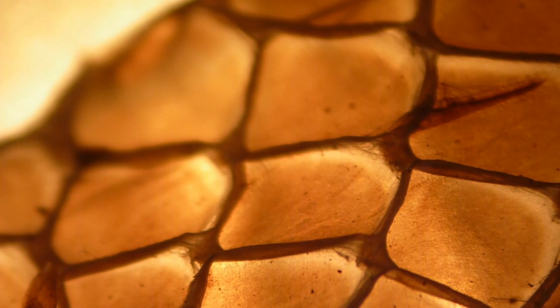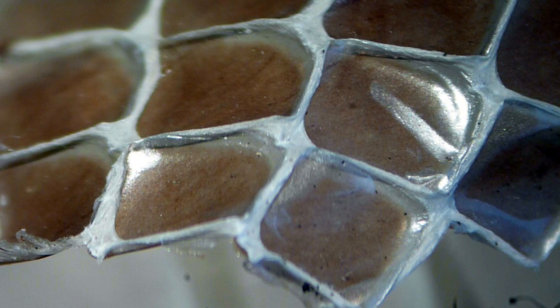I have to admit this is not the most exciting type of specimen - there's not a lot of movement going on. Water samples are probably more exciting because you actually see paramecia and water organisms move around. This is a rather static specimen, but it's still interesting to look at. That's the bottom light, and now I'm using the top light again. And another photograph.